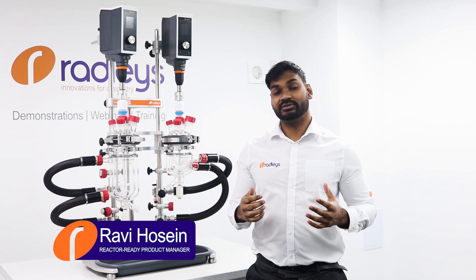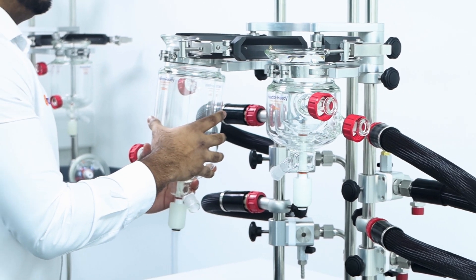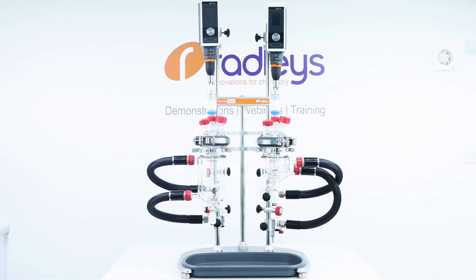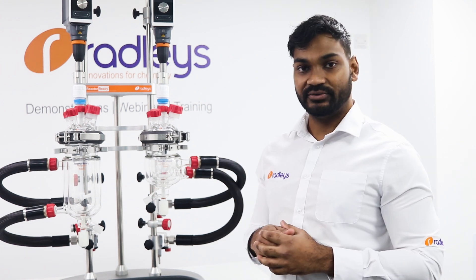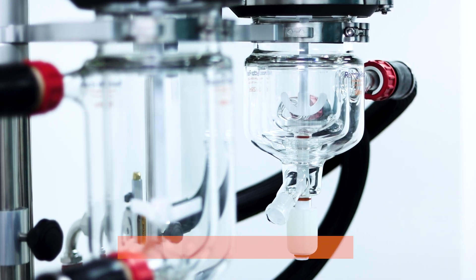Today I'm going to be showing you Radley's Reactor Ready Duo Jacketed Lab Reaction System. Reactor Ready Duo allows you to have two independent jacketed glass reaction vessels from 100ml to 5L on a single compact framework.